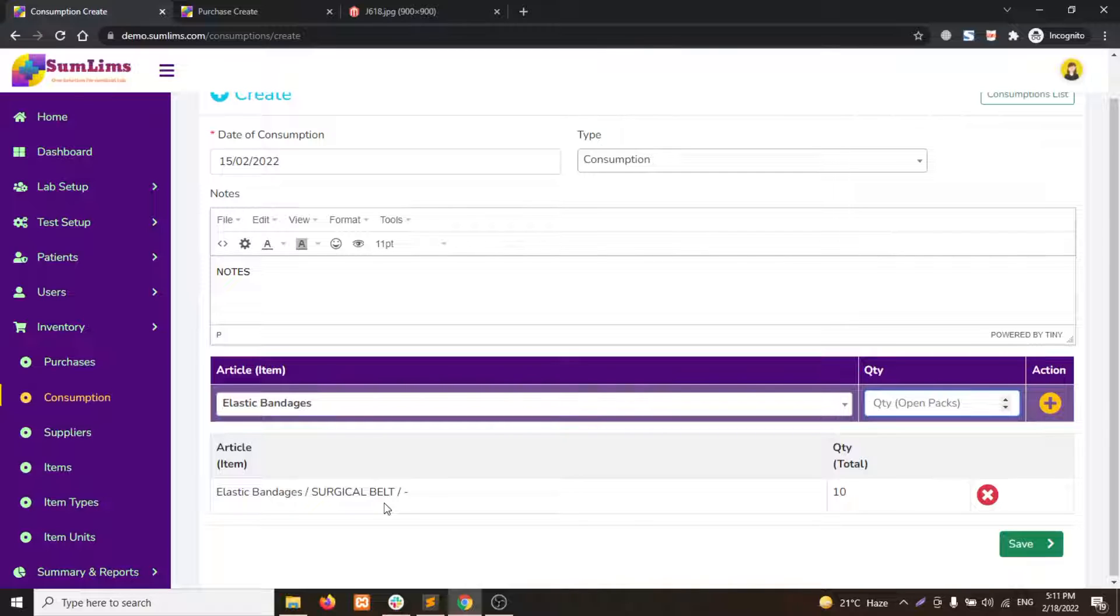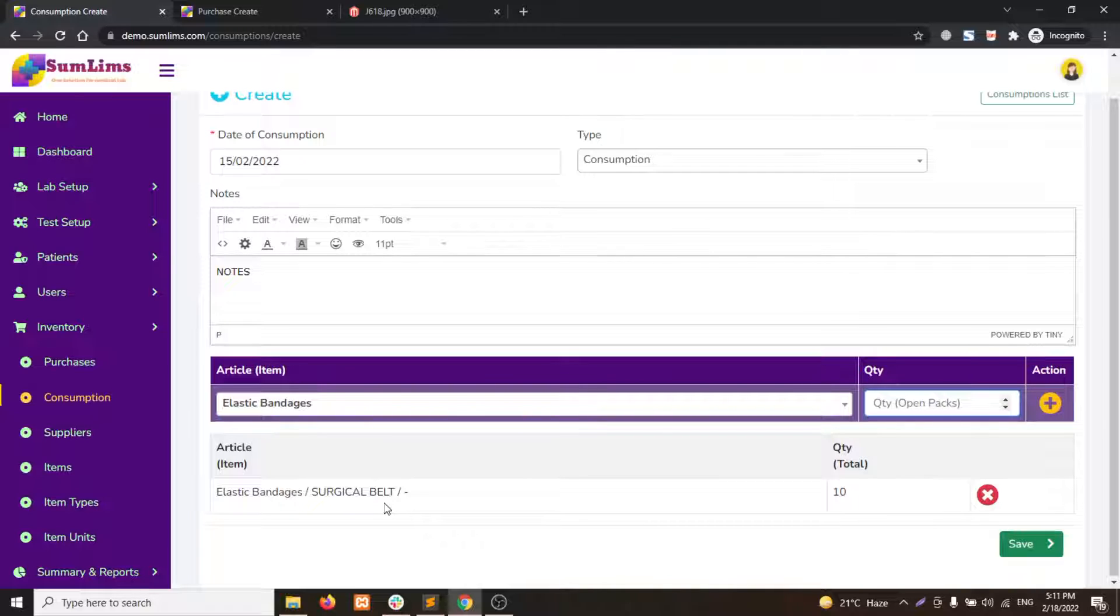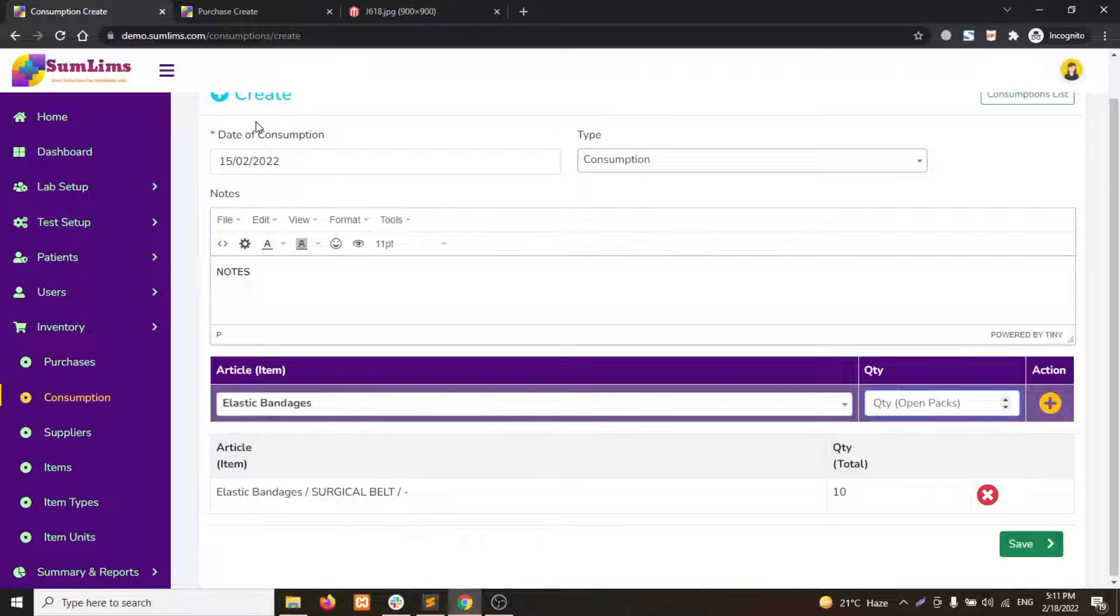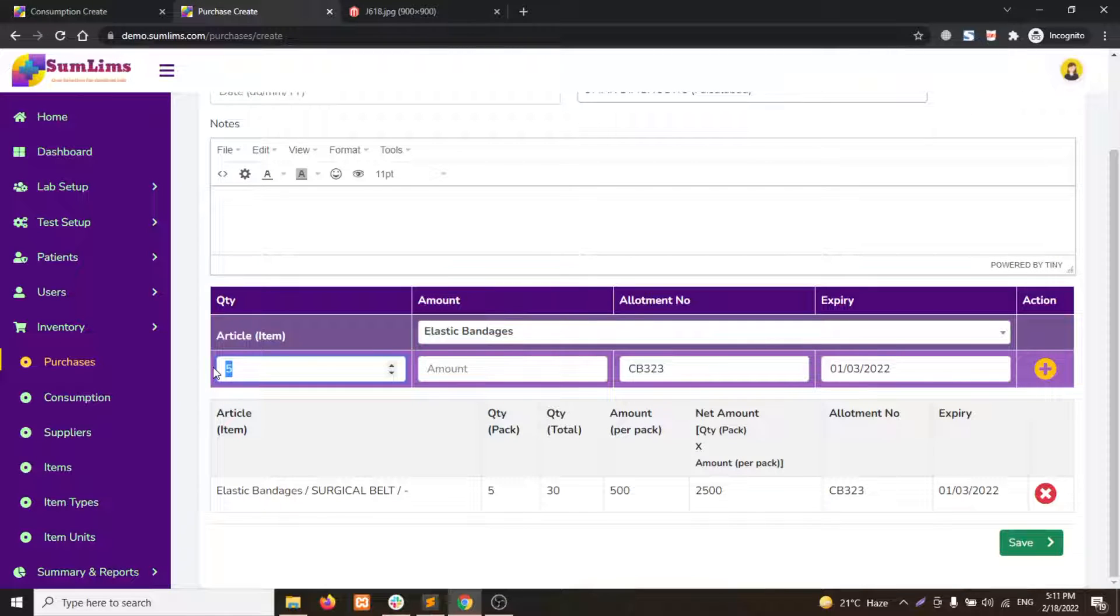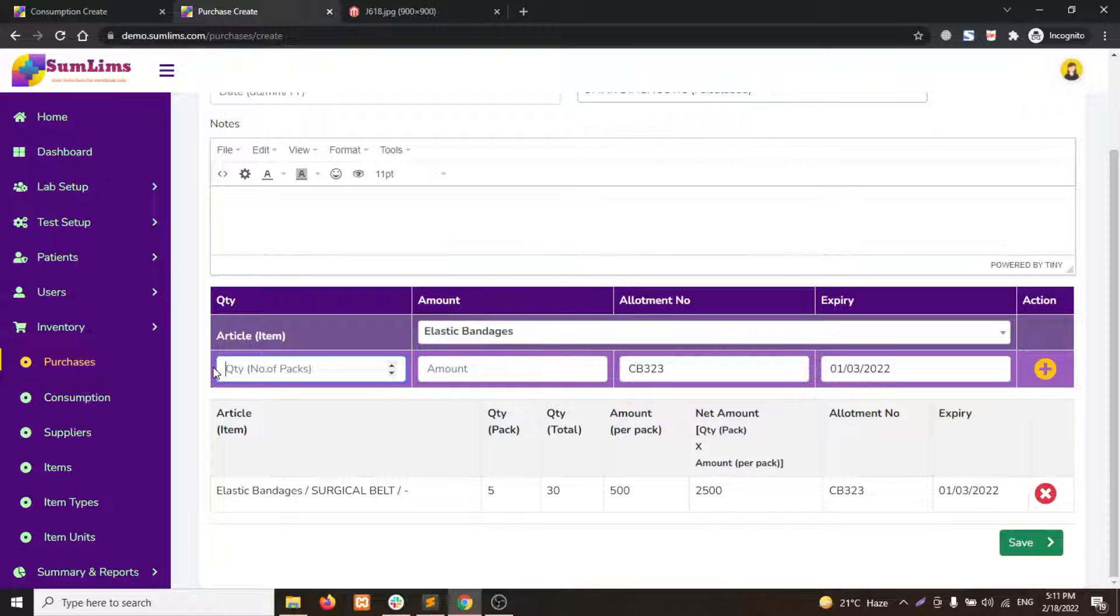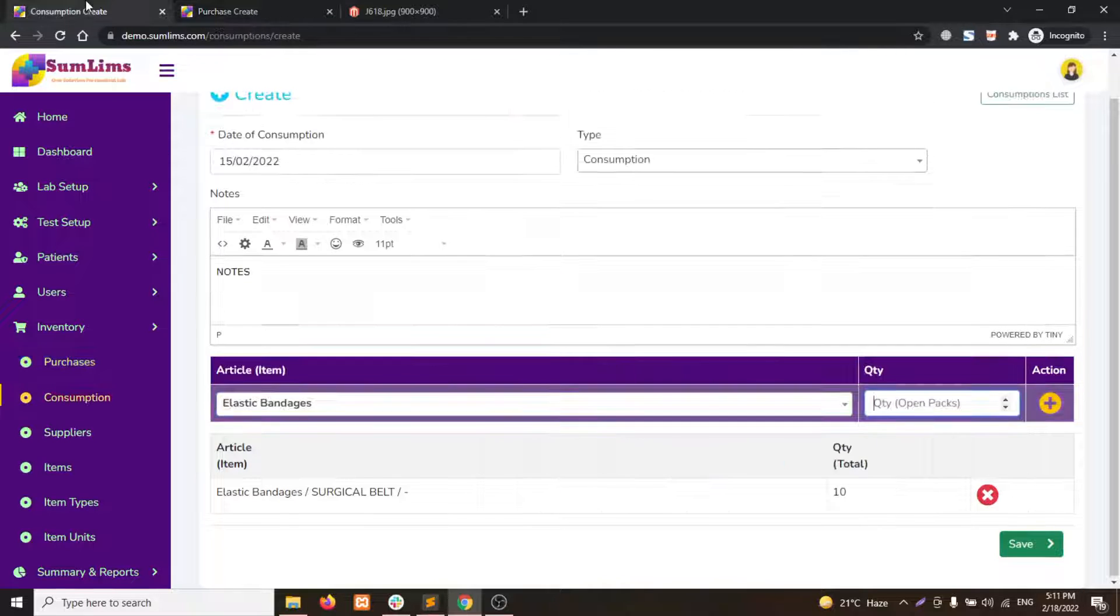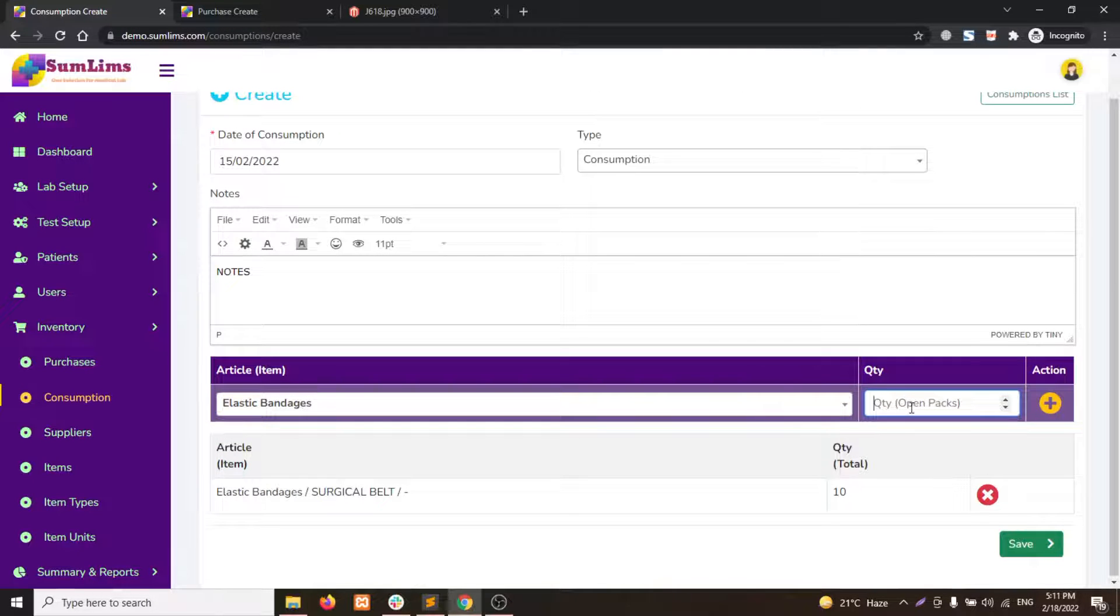Important point to note here is that this quantity is open quantity. Unlike purchases where we add the quantity in bulk, that is the number of packs, here in consumption or wastages we write down the open quantity.